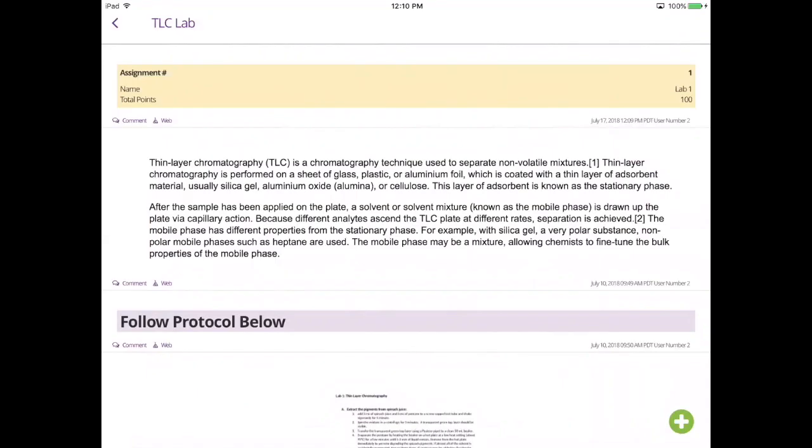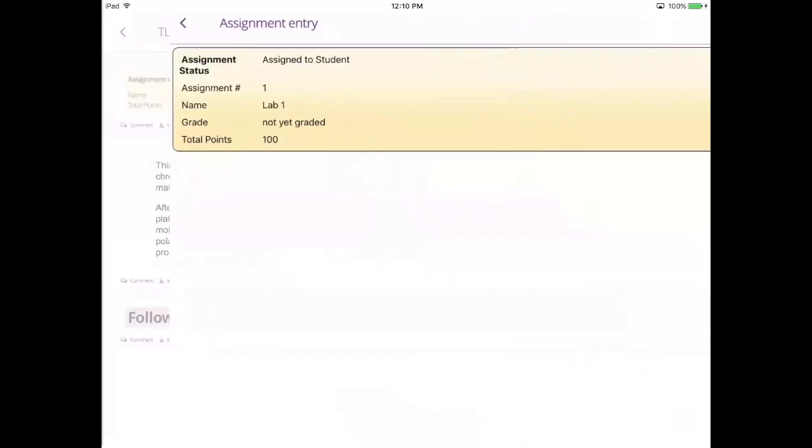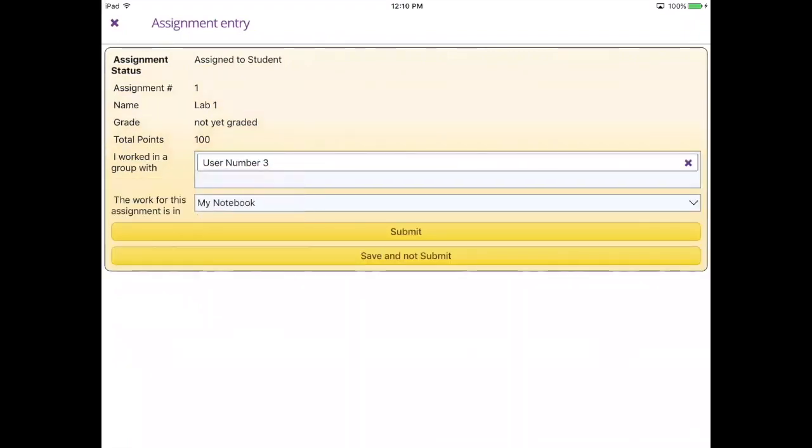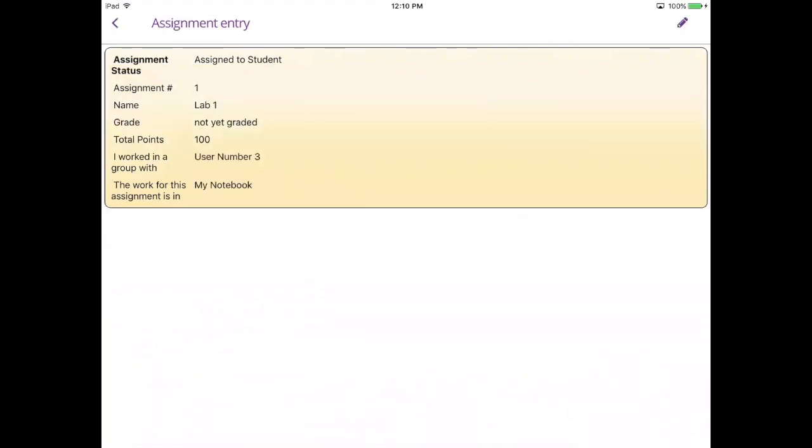Students can submit assignments using the assignment entry. Click the pencil icon on the top right, indicate any group members that you have and where the work is located, and click submit.